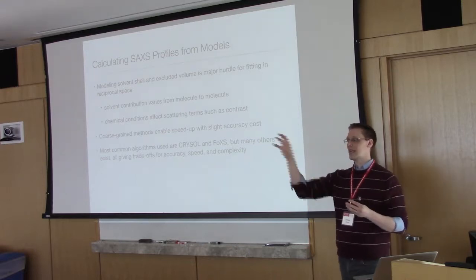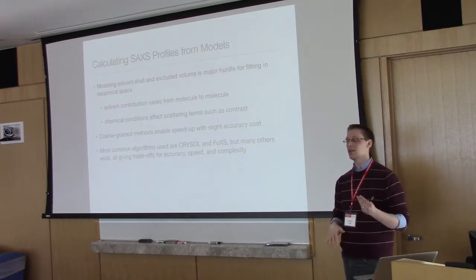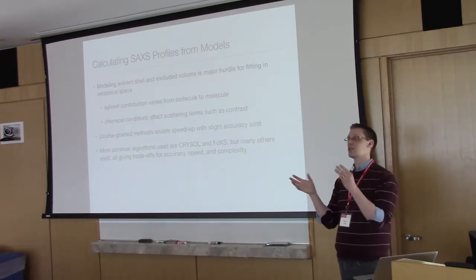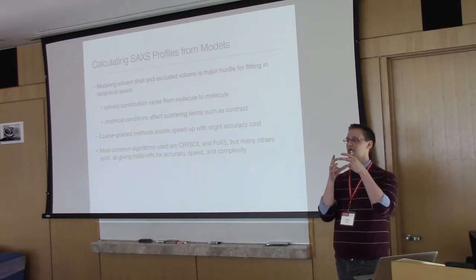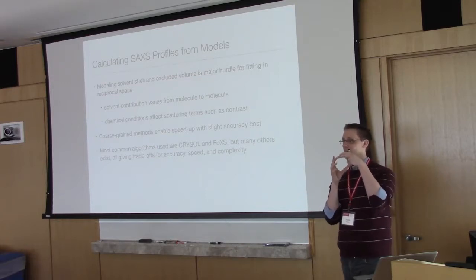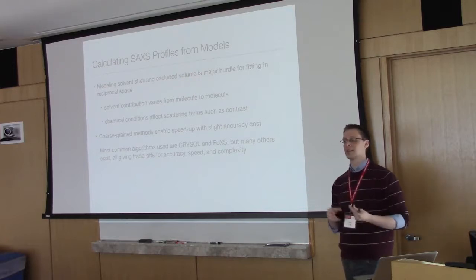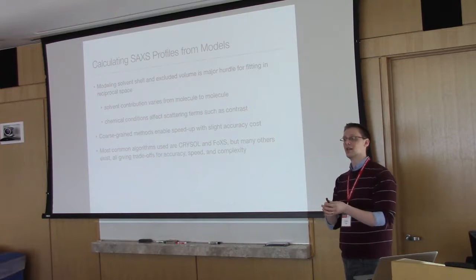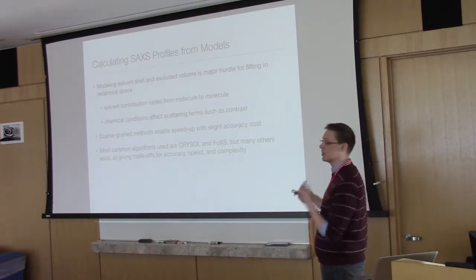And then the proteins are taking up some volume, which means when you subtract the water, you're not subtracting the bulk solvent around the molecules of protein. You're subtracting all of it, which means it's assuming that there was some water where the protein was. And so that's what we call excluded volume. You have to account for the fact that your protein is excluding some of the water that was in the buffer blank that you shot. And so you have to account for these two terms.